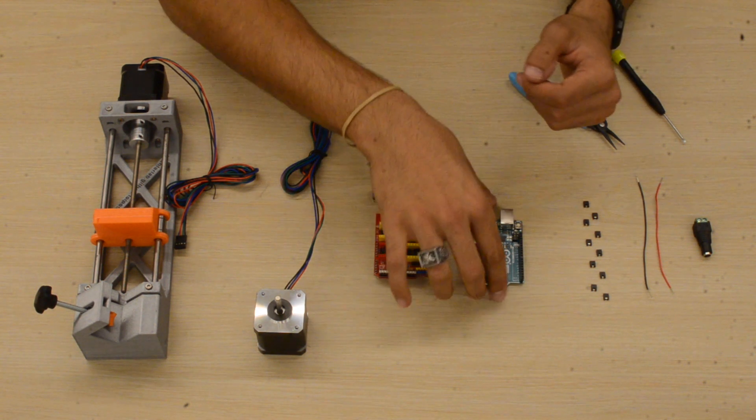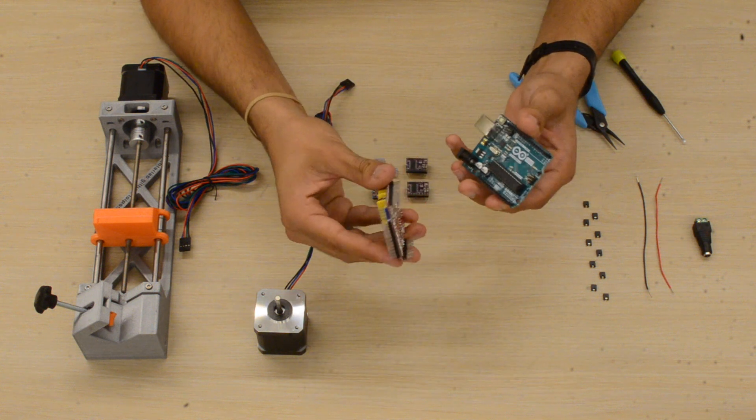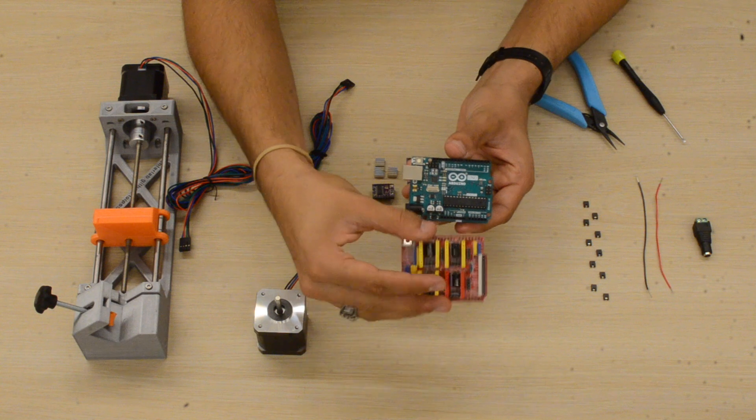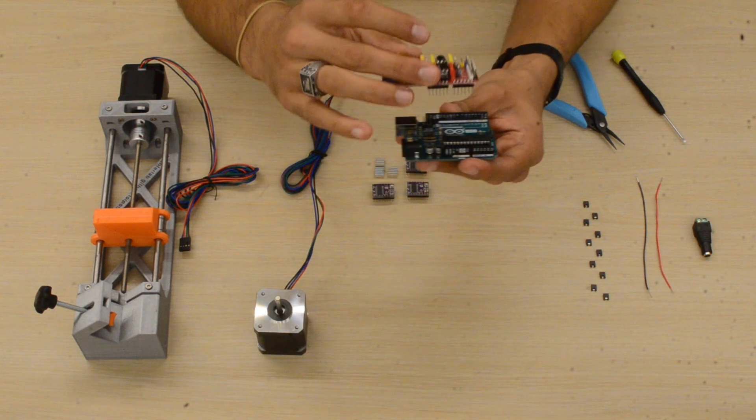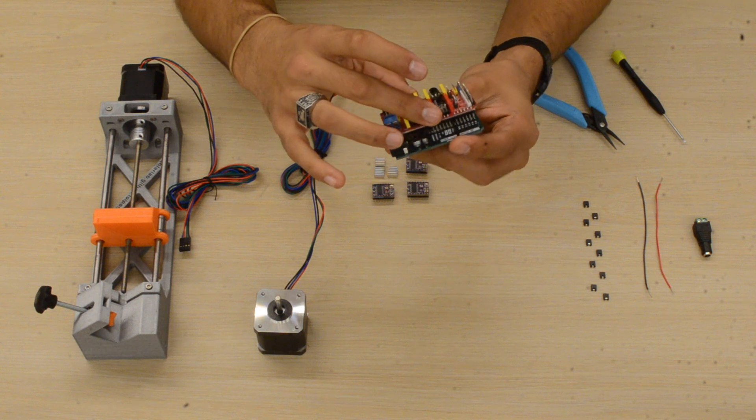First, grab the Arduino Uno and the CNC shield. Plug the CNC shield into the Arduino Uno according to the pins—it's pretty straightforward, they should align very easily. Once aligned, push the two boards together.